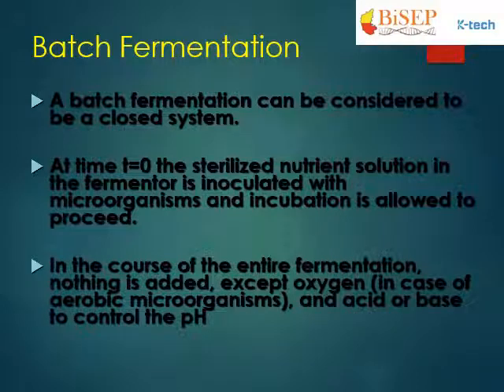So coming to fermentation, here we will go through what a batch fermentation is. A batch fermentation is a closed type of fermentation. It is a closed system at time t equals the initial time 0. The sterilized nutrient solution in the fermenter is inoculated with the microorganisms and incubation is allowed to proceed. In the course of the entire fermentation, nothing is added. Only dissolved oxygen levels are maintained, if it is an aerobic fermentation, along with acid and base to control the pH.